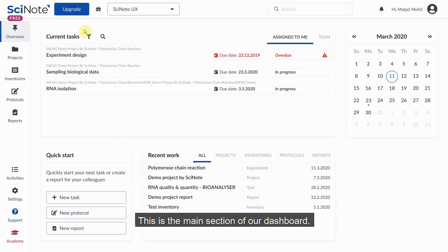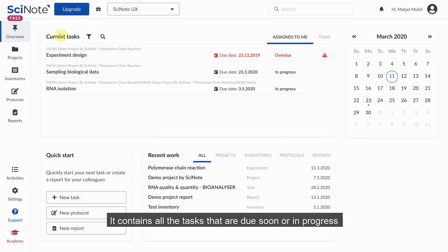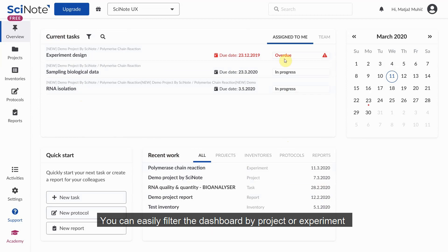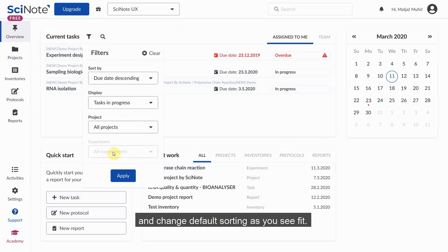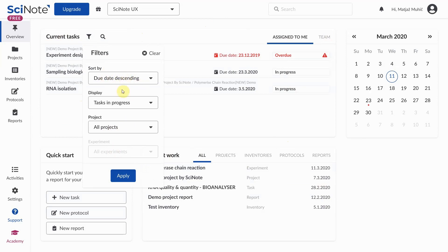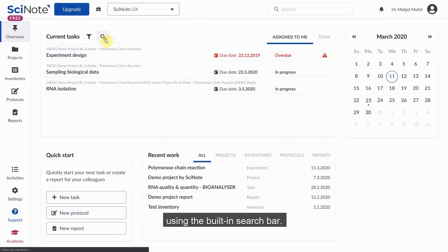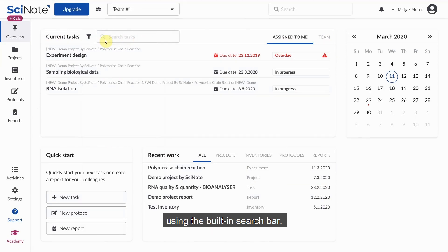This is the main section of our dashboard. It contains all the tasks that are due soon or in progress, showing you what to focus on. You can easily filter the dashboard by project or experiment and change the default sorting as you see fit. If you have a specific task in mind, you can also search for it directly using the built-in search bar.